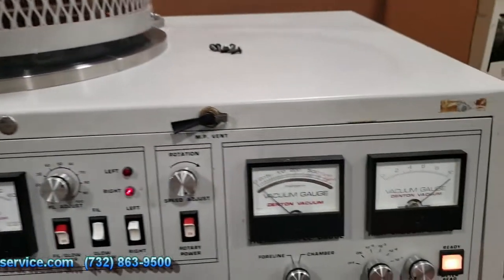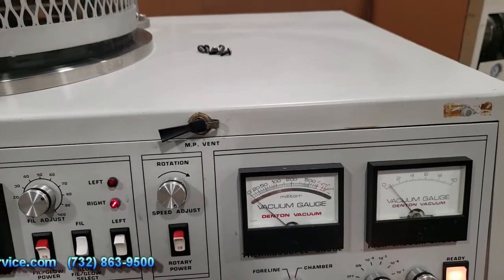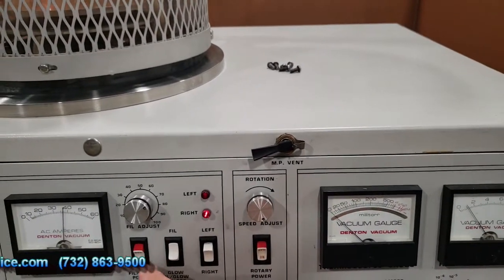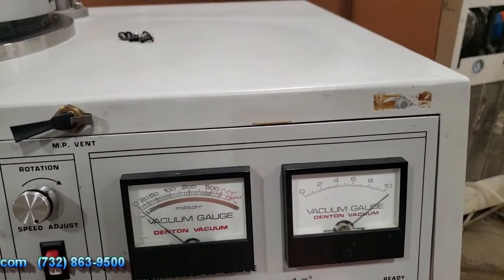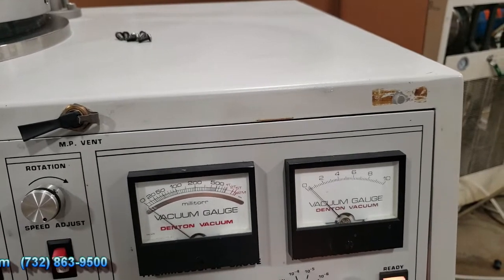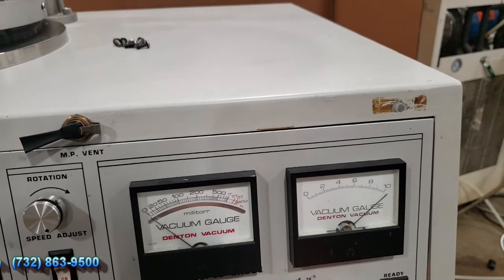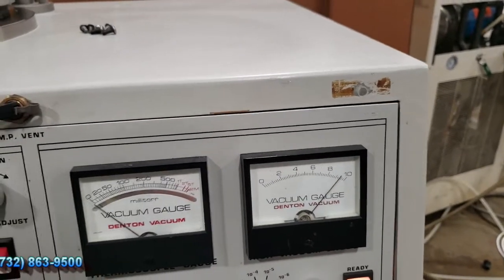And then I'm going to turn on rotation by turning this on, and you can see the table spinning around. So you can see that the pressure has moved up, so I can drop it back down. I'll shut it off and you can see it will start dropping back down again - it's in a five range, and you can see it's starting to come down into the six range.